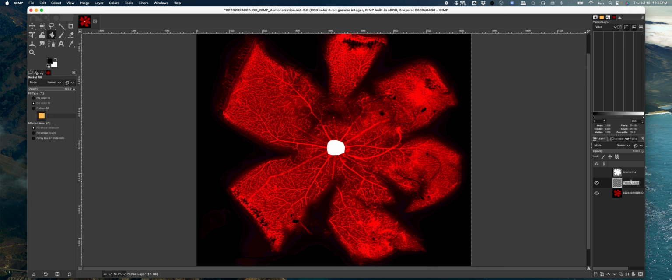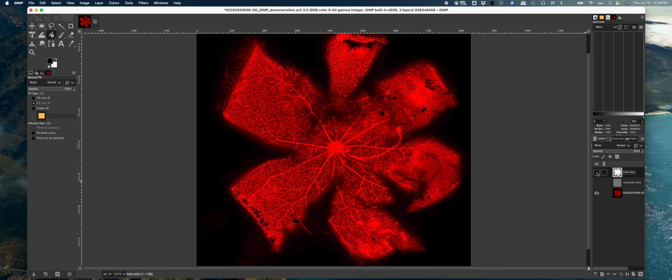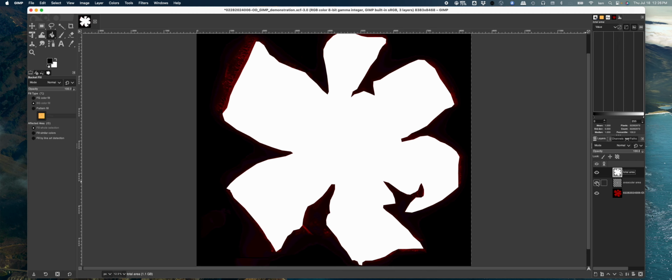So now I'm just going to label that. And then maybe I'm going to just rename this one what it is. Total area. There we go. Boom. So you can have these layers off. You can save JPEGs of these or TIFFs or whatever you're going to need for illustration purposes, but mostly right now this is a beautiful file format. It has exactly what we've outlined that's responsible for the number. This is all what you would call traceable data, can be re-examined at any time.